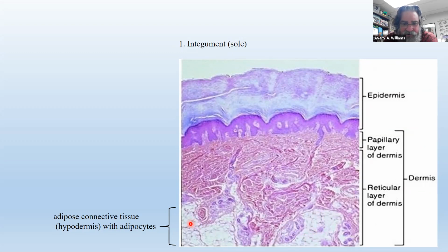I'm going to have them zoom in and show you a close-up of them here in a little bit. But they're large, thin-walled cells that contain a lipid droplet. And when you have collections of adipocytes, you produce adipose connective tissue, or you commonly refer to adipose connective tissue as fat. That's what fat looks like. This is fat underneath the microscope right here. And fat is made out of adipocytes or adipose connective tissue, okay?